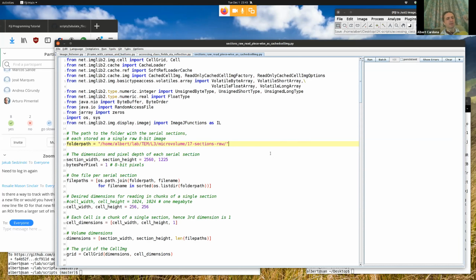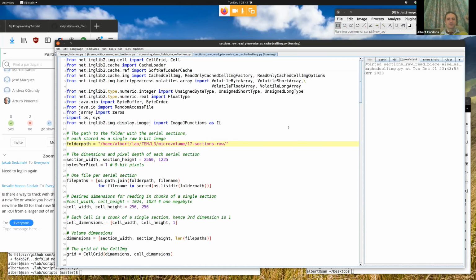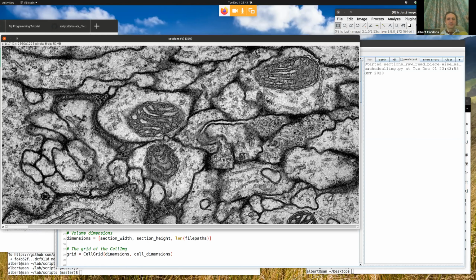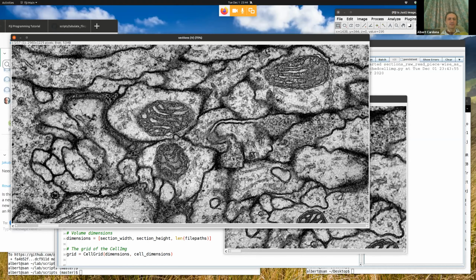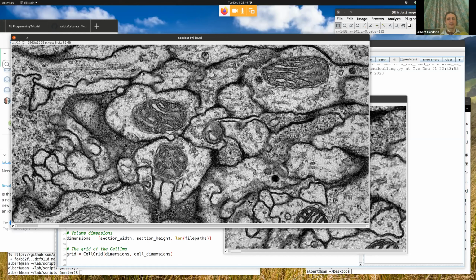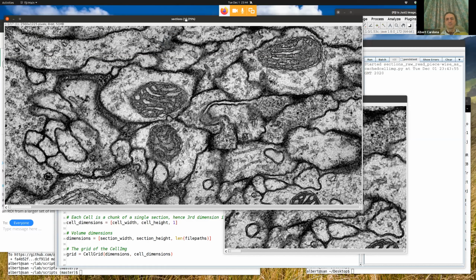So then what can you do with that? Well, something you can do is load only parts of the image. You don't need to load the whole image. So it is a script, and I'm going to run it now to show you what I mean. Here, this is only a small image, but it's a little stack that will serve as a test. Suppose this was a giga-enormous image, it would take too long to load if you want to browse through the z-axis, say, effectively.